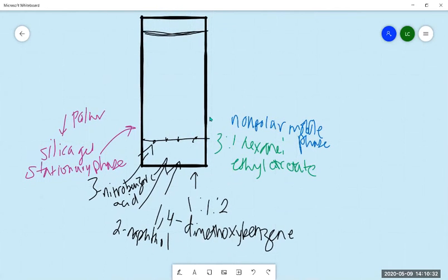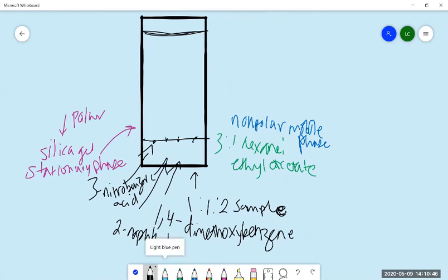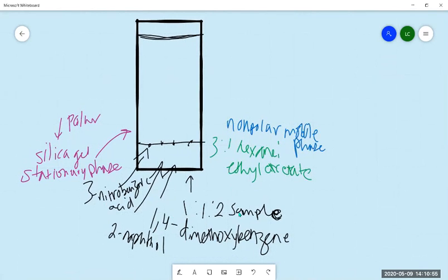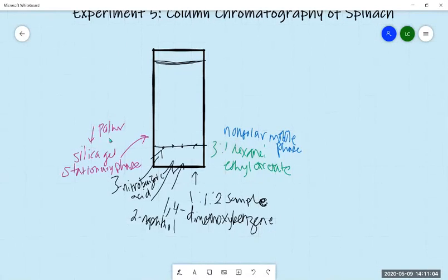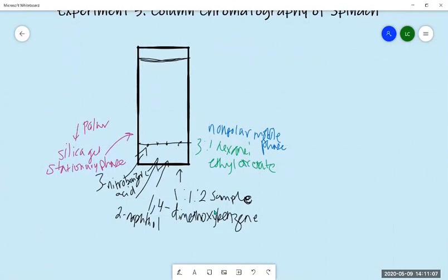The different components that you have, of course, have different polarities, so they will elute, and the relative order will usually be the same, and so you will get a separation. You either get no separation or you get a separation, but you do want a polarity gradient that allows you to separate your compounds. You can change your mobile phase composition. You usually don't change the stationary phase; you can't really do that. And then you should get a separation of some sort.